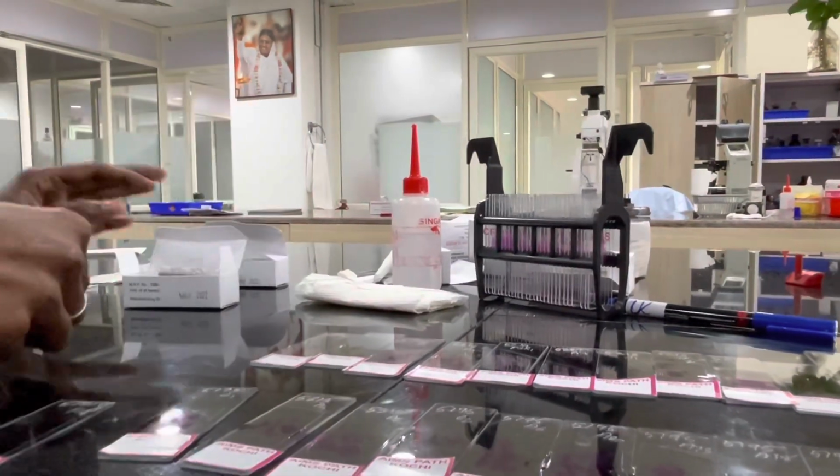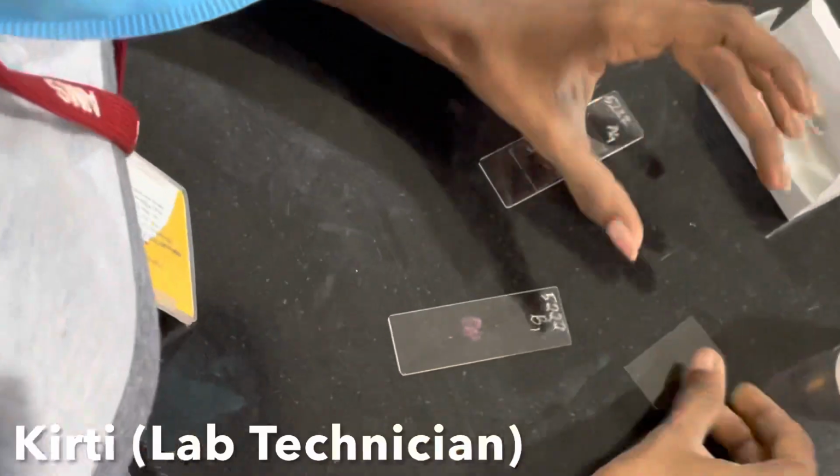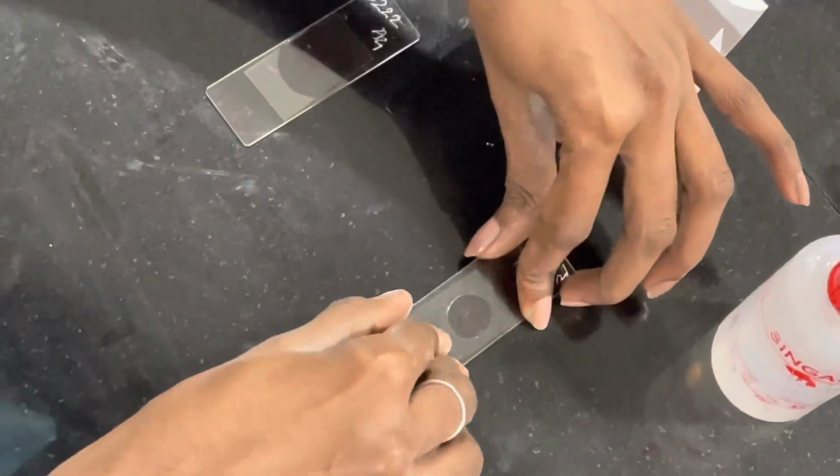The next step is mounting. As we can see here, the lab technician is placing a drop of DPX mountant on the cover slip and the slide is placed over it.